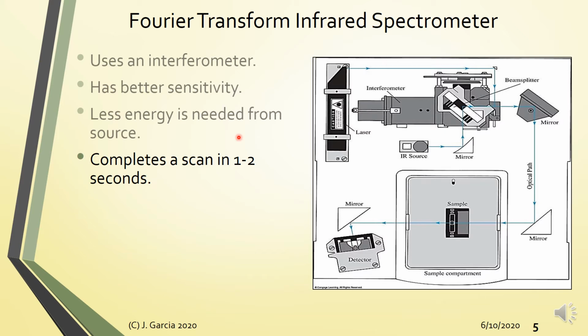Remember, with a dispersive monochromator, the dispersive element moves, and only after each movement does it hit the particular wavelength or wave number whose transmittance or absorbance you want to measure. And since the sensitivity of your detector is low, you need to expose it for a long time to that particular wave number before you move to the next wave number value. That is what lengthens the analysis.